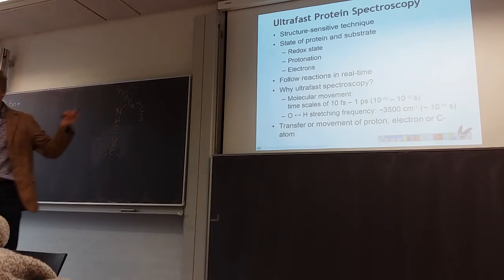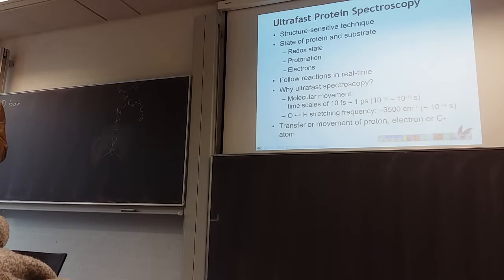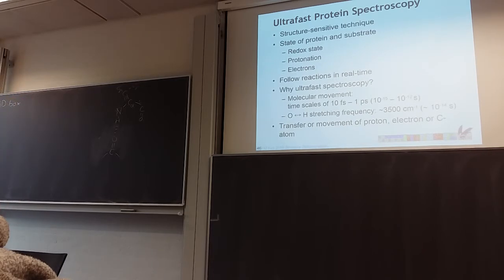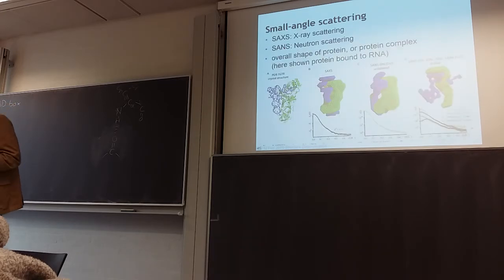What's cool about the regular spectroscopy is that you can do very, very fast measurements. So you can do femtosecond spectroscopy measurements that allow you to track chemical reactions as they happen in your protein, in your enzyme, on the go. Or you can monitor folding and unfolding transitions. If you heat up your protein sample, you can, with spectroscopy, follow how certain absorptions change as a residue that was in the inside of your protein molecule in the folded state now becomes exposed to the water and changes its spectroscopic properties.